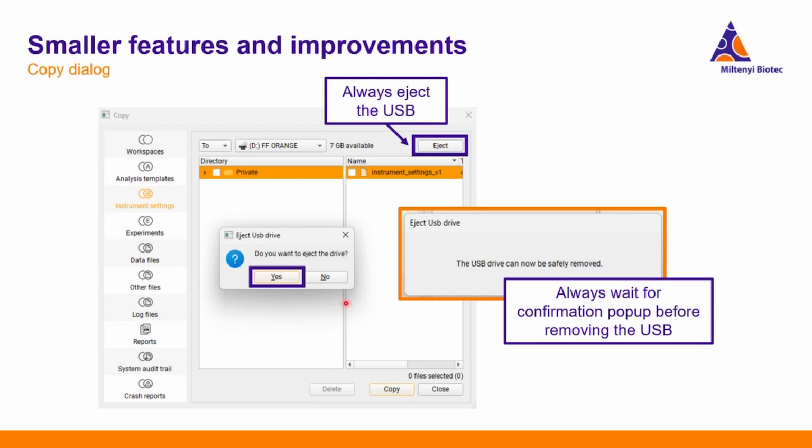This is still the same. Please always eject your USB sticks after you copied something. There is now a pop-up coming which confirms that it's now safe to remove. So this is the new feature here. So please always wait for this pop-up before you take out the USB.